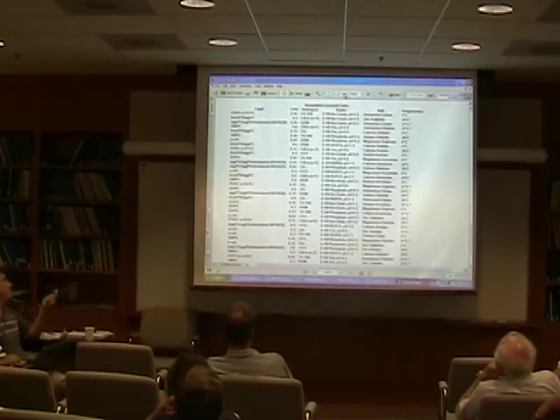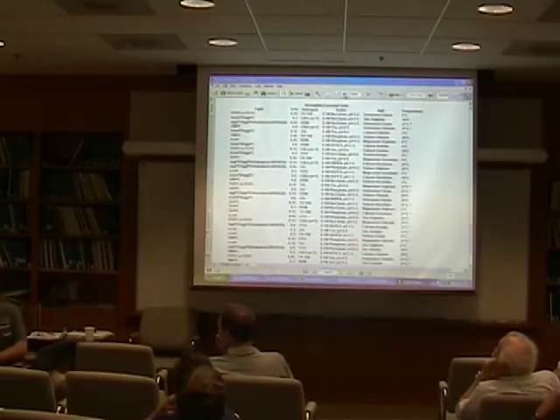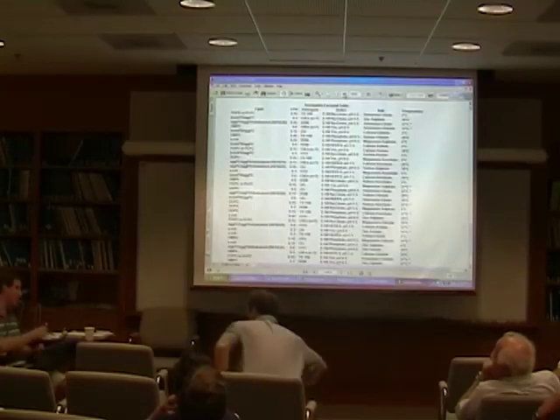So essentially, you've just got a random combination of lipids, lipid to protein ratio, detergent, buffer, salt, and temperature in 35 conditions, which you could then throw your protein at. They're not all going to work. You don't expect them all to work, but it will give you an idea for what you would use for secondary and tertiary screens in the future. Okay, so that's the ideology behind the design.